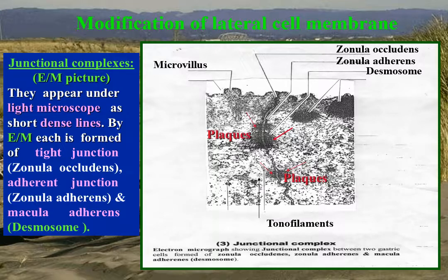Notice the presence of microvilli on the free surface of the cell, together with cell coat or glycocalyx. Secretory granules appear as electron-dense granules near the top of the cell to be discharged, while ribosomes appear as small dense granules in the basal part of the cell for the synthesis of the proteins and the secretory products.